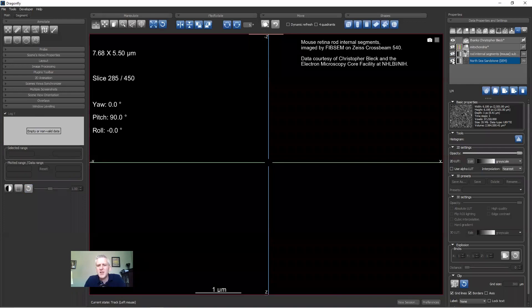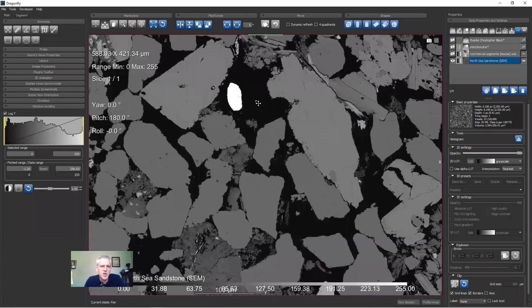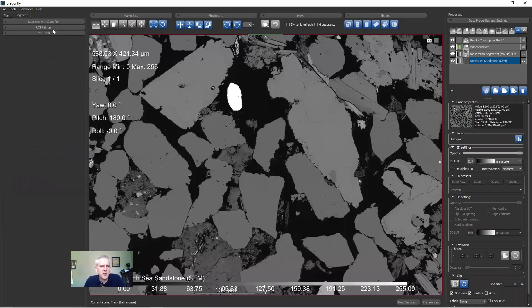Let's look at the 2D SEM image. Here we're looking at an SEM image of sandstone. Image segmentation is labeling the different pixels in the image — maybe not all pixels, but the pixels of interest. If we're concerned with porosity, we label the pore-space pixels. If we're interested in quartz or feldspar fraction, we label the different grains by material components. All of that gets started on the Segment tab, which has three panels: Segment with Classifier, ROI Painter, and ROI Tools — and we'll look at ROI Tools today.